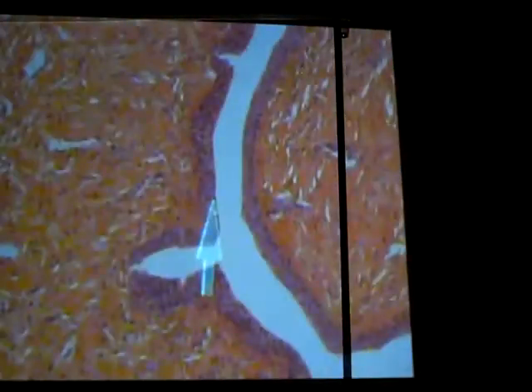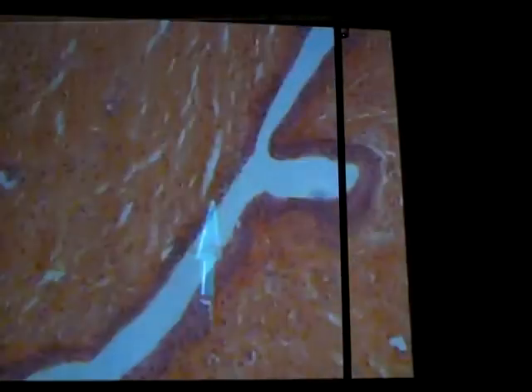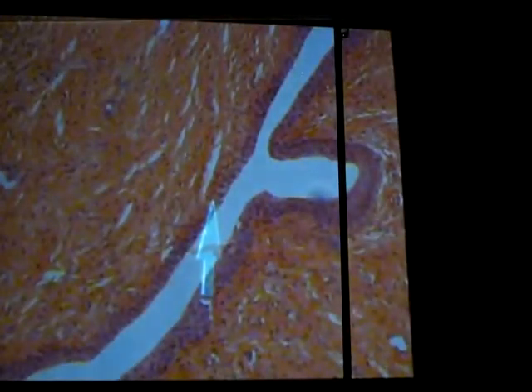Alright, so again, this is a single tube. You see that U-shaped lumen. You see the transition, well, not in all the slides, but you might see the transition from transitional epithelia to stratified squamous, and you'll see these venous sinuses present. Alright, and in some of them, you'll see the transition from the stratified squamous non-keratinized to keratinized epithelium as you move towards the outside. Alright, so that's it for urinary.